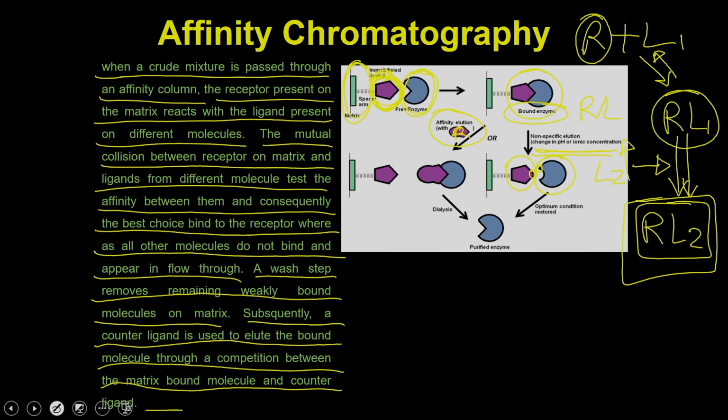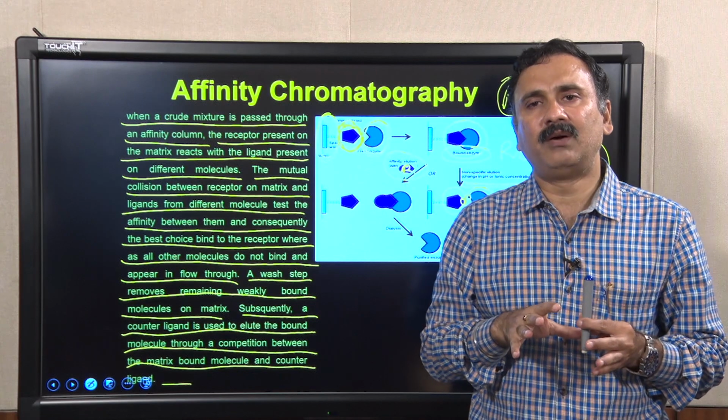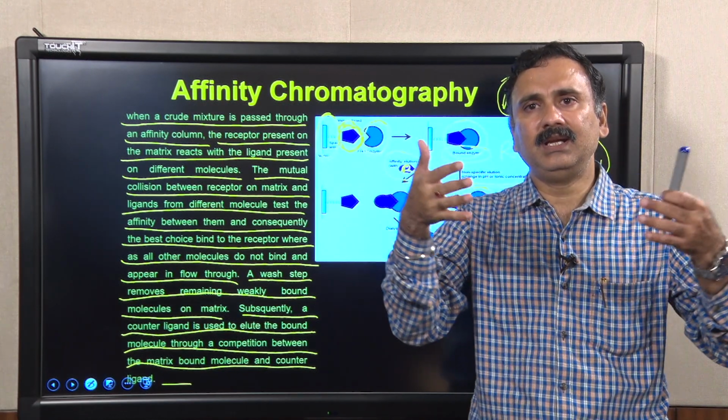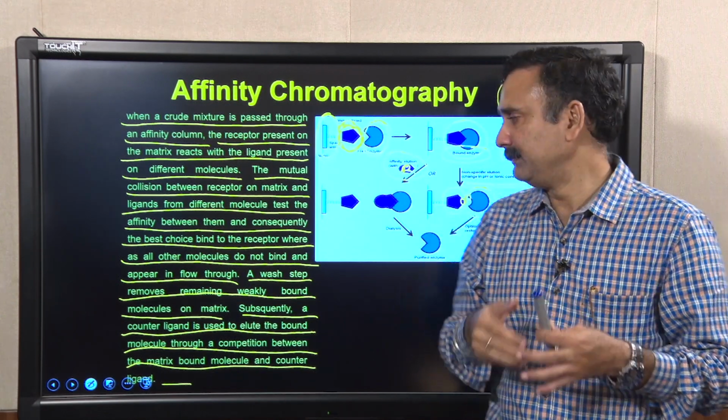So, this is the basic principle through which you can exploit the affinity phenomenon to purify the different complexes, exploiting the receptor-ligand concept, or the affinity concept.